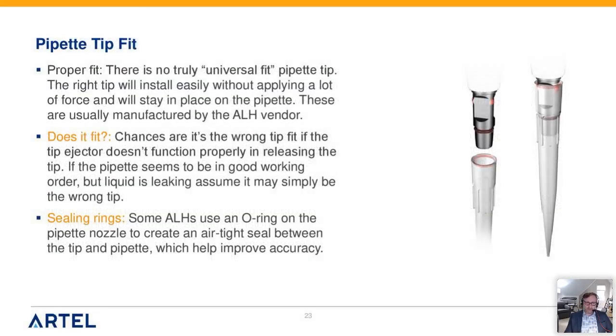And why I bring all of that up, we've got to think about the fit. The question that you need to ask yourself when you're buying a universal tip is, is this truly universal? And really there are no truly universal tips. It's about the fit. If you have to jam the tips on, if you have to set a higher force on your automated liquid handler to get some universal tip to seat well, it's probably not the appropriate tip.